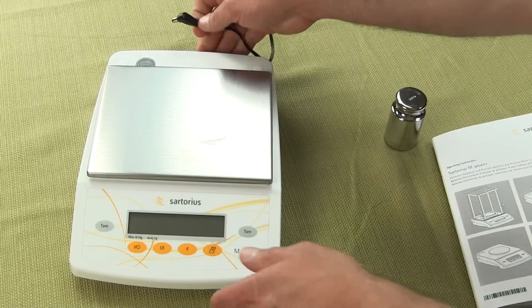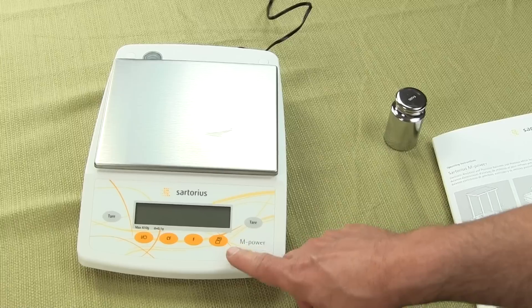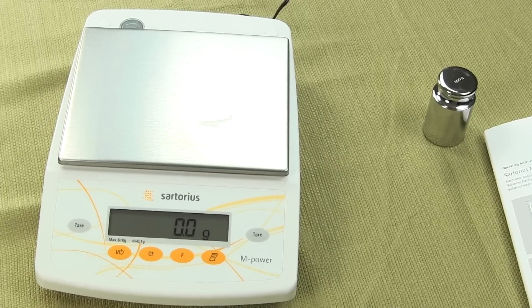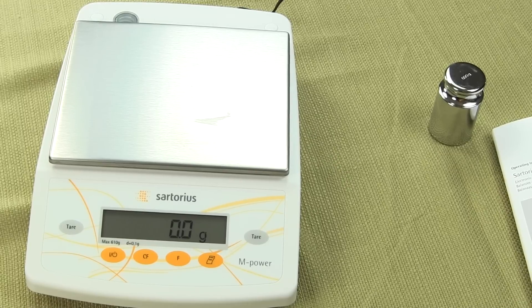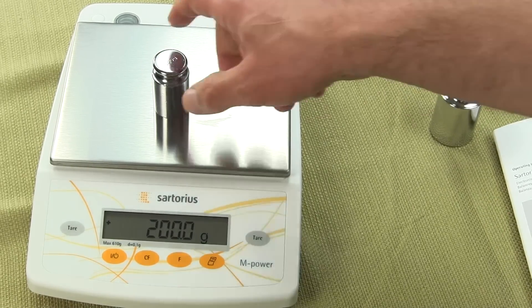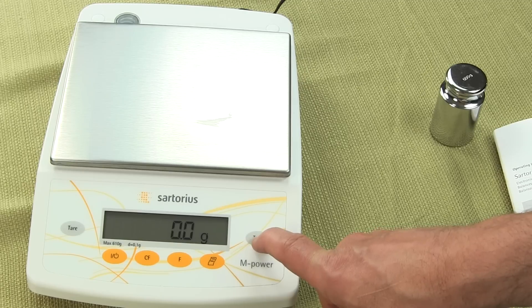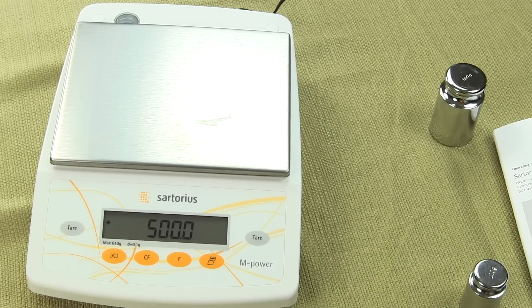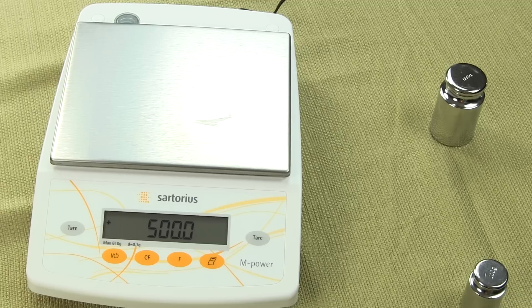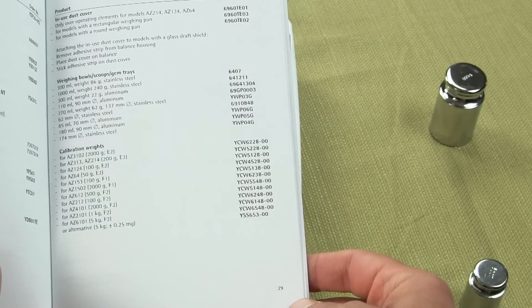I'd like to go over how to calibrate the scale — it's very easy to do. To do calibration, all one needs to do is hold the tare key down and the balance will flash the weight that's needed. On all of the AZ series, calibration weights are not user selectable — you have to purchase the correct calibration weight. Those calibration weights are all listed in the user manual on page 29. Every model is listed there for what weight is needed.